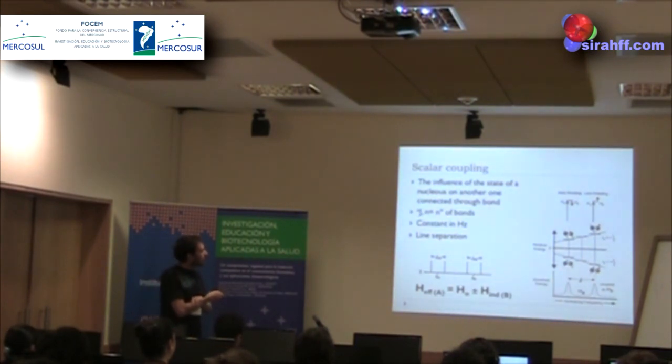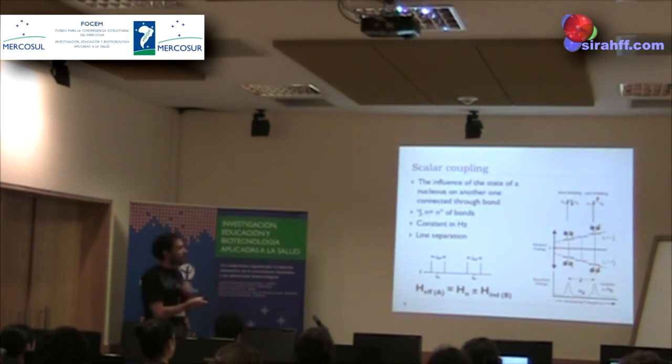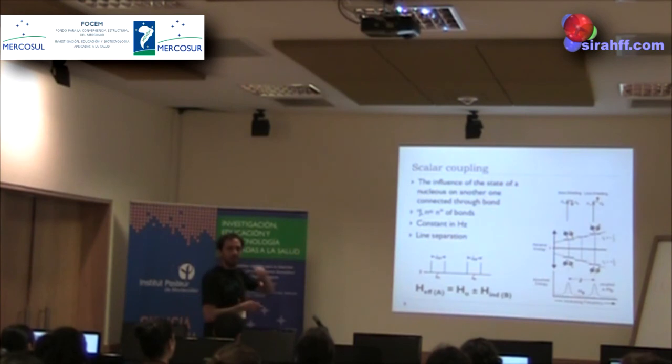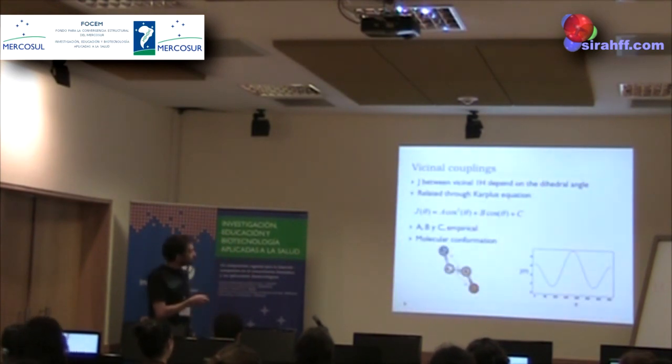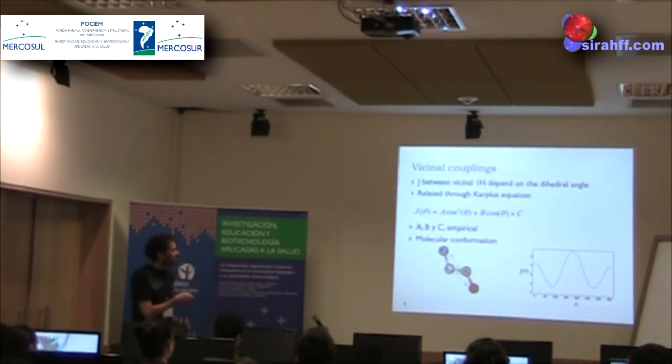This scalar coupling is constant in Hertz, as is the separation in Hertz. And what's more important, these scalar couplings can transmit information between different nuclei. They also give information about dihedral angles, and here we have this guy who got the Nobel Prize. I think he got a Nobel Prize for things more interesting than this equation, but it's rather simple.